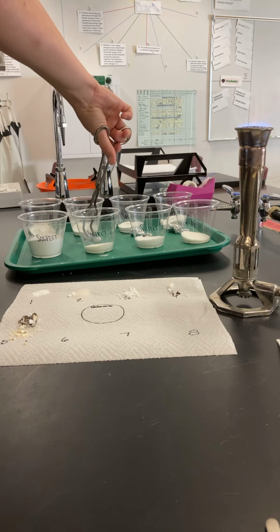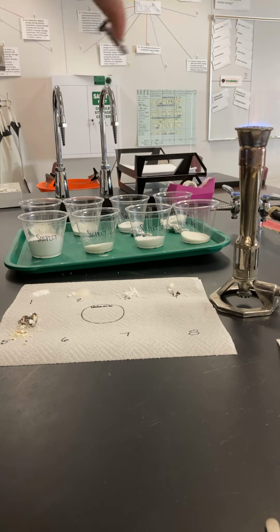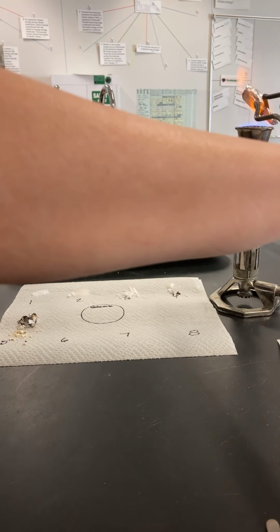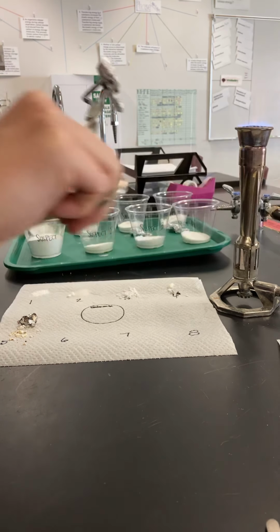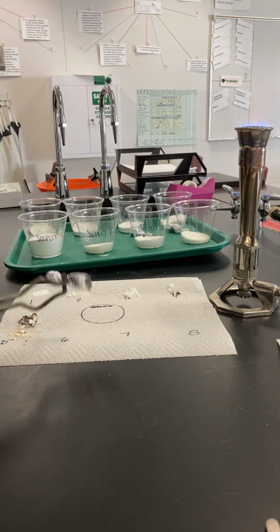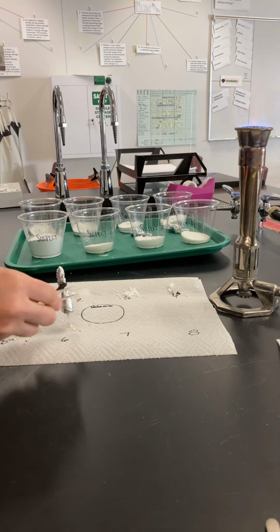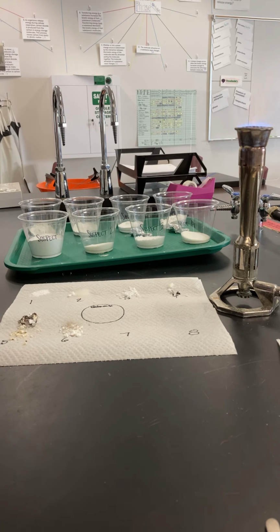Substance 6. 1, 2, 3, 4, 5. Okay, this one didn't look like it melted, but it definitely burned. So it definitely turned black around parts of it, but none of it actually melted, just formed clumps. Again, not from melting. Okay?